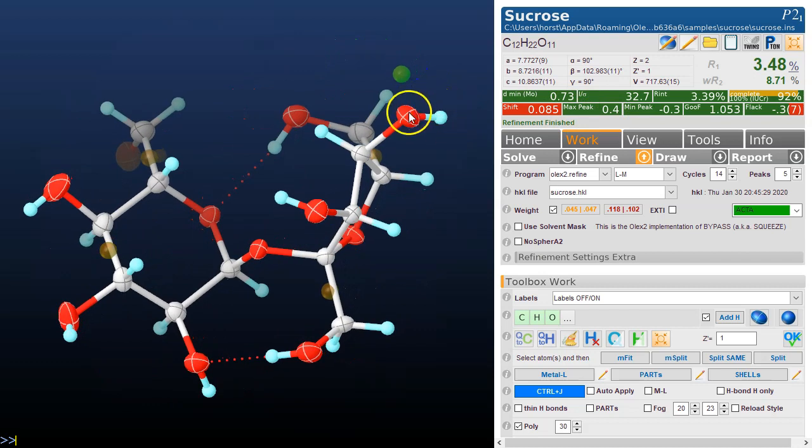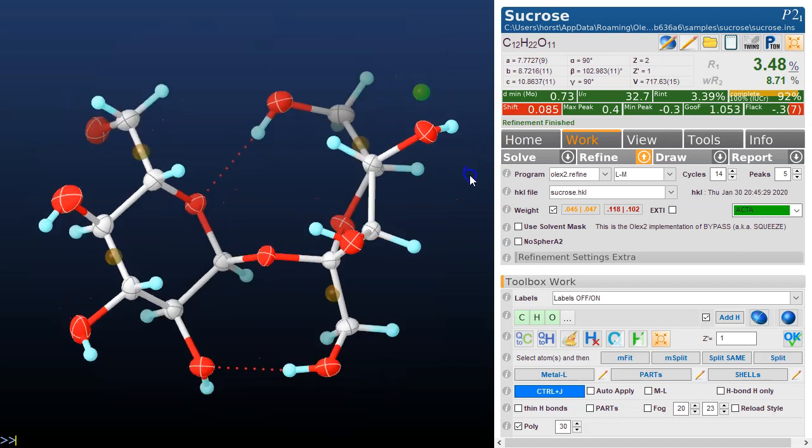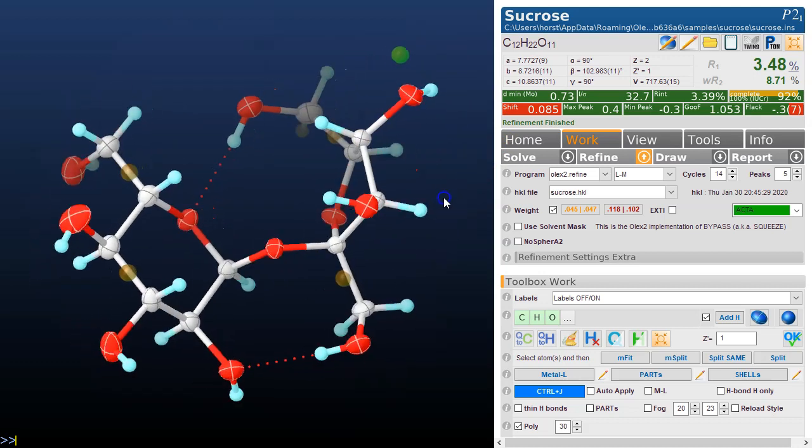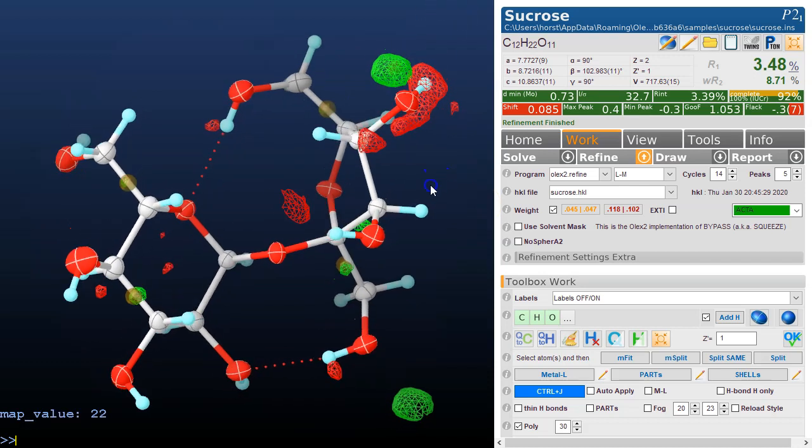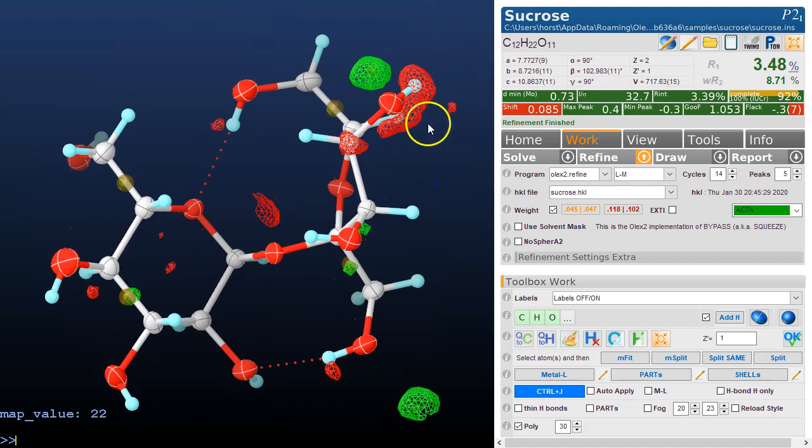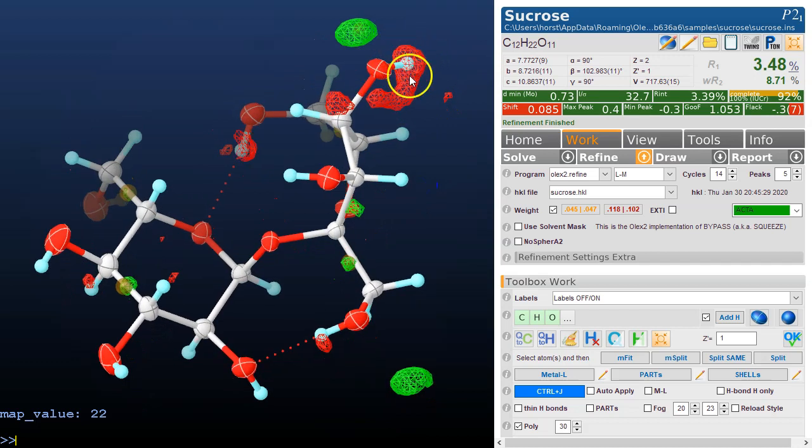This may be that this hydrogen isn't actually over here but in reality it should be over here somewhere. The peaks themselves are pretty good indicators, but if you go Ctrl+M it's much more clear what's happening. This hydrogen is not really here, it's really over here, so what we should do is maybe a few more cycles of refinement.